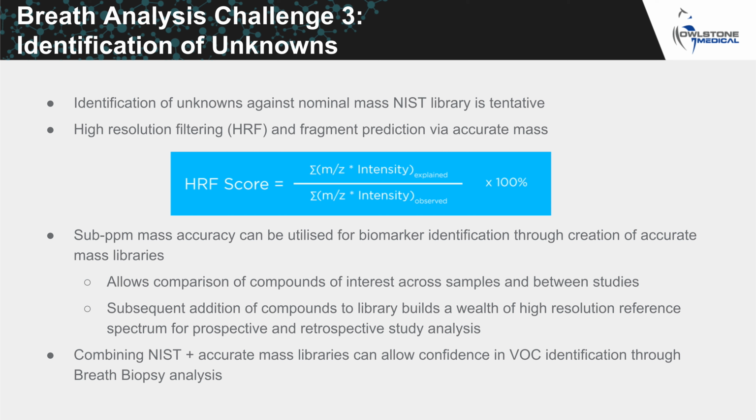This can also be combined with the NIST library. So we can use standard libraries alongside the high resolution libraries at the same time, meaning we can continue to offer tentative identification for VOCs that aren't in our accurate mass libraries yet.